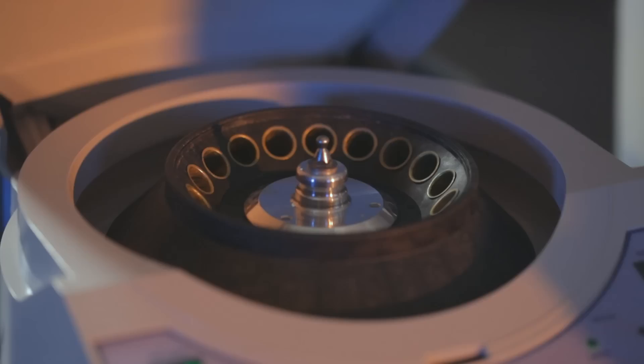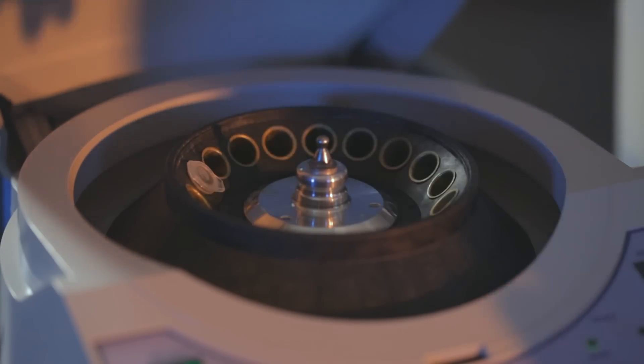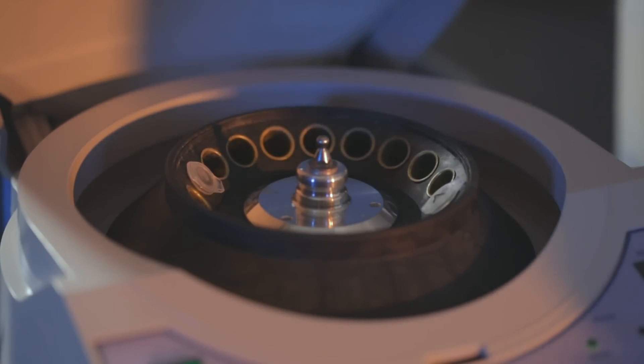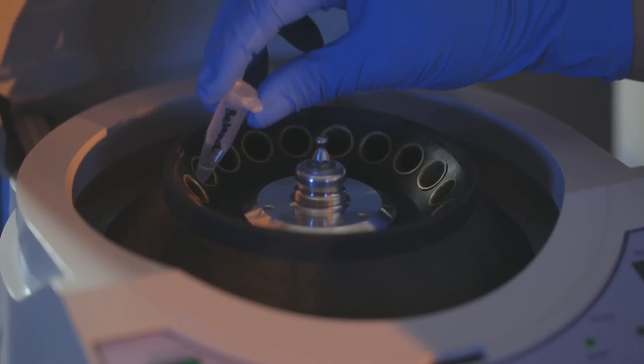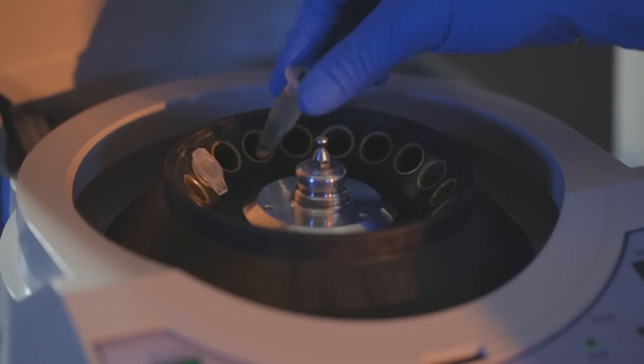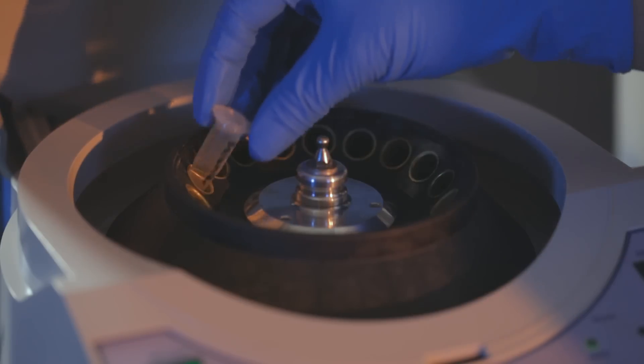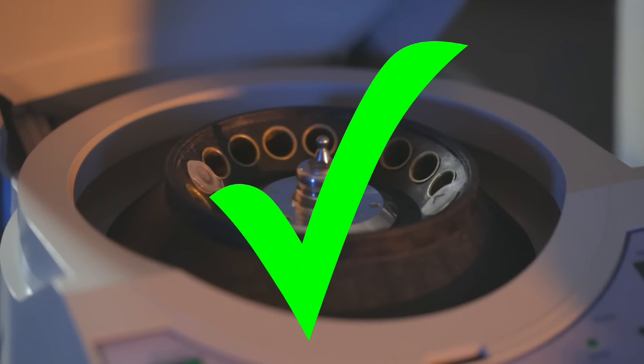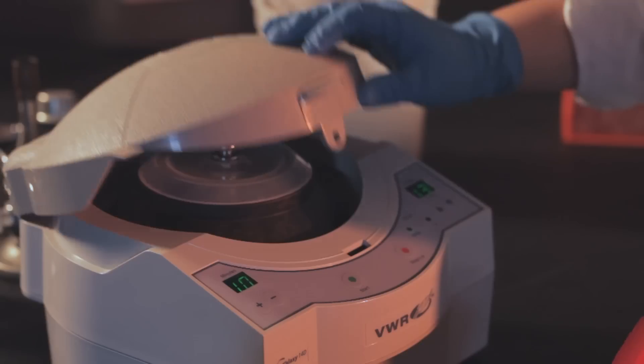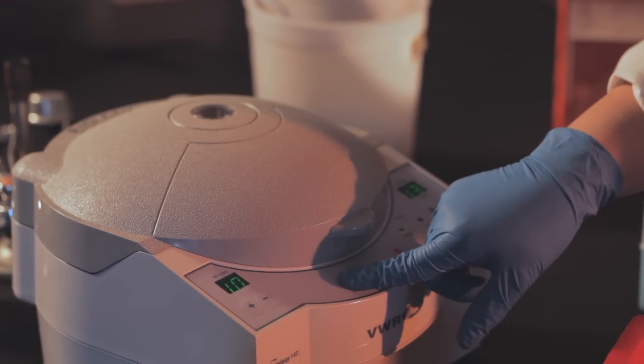You will now harvest the bacterial cells from the culture by centrifugation. Place the microfuge tubes in a tabletop microcentrifuge and spin for one minute at full speed. Be sure to balance the centrifuge before starting it. This means that an identical tube containing an identical volume of solution should be directly across from your tube. Don't forget to secure the inner lid if your centrifuge requires one.